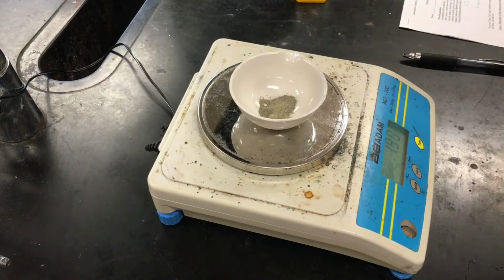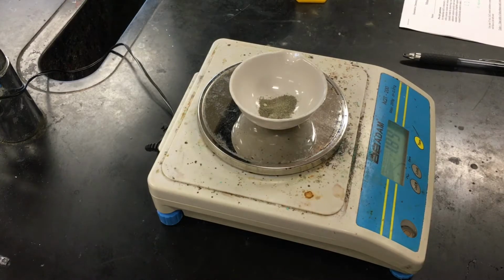Perfect. And then we have to use this copper chloride to make 35 milliliters of solution.